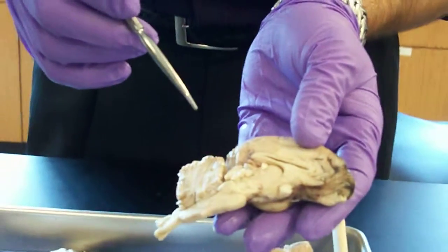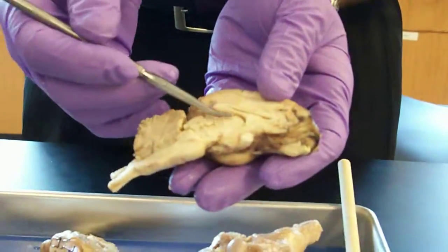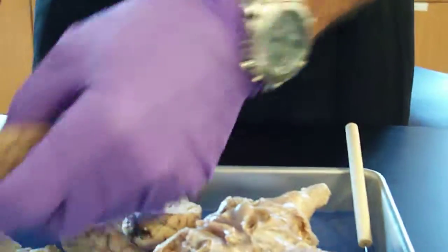And did you hit the pineal body? I think you got the other ones.